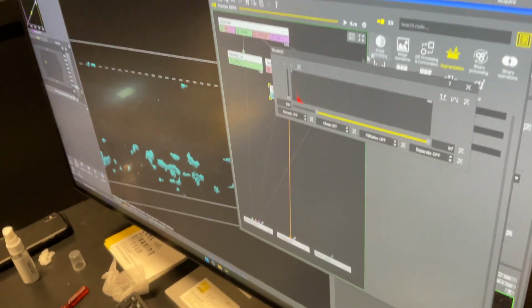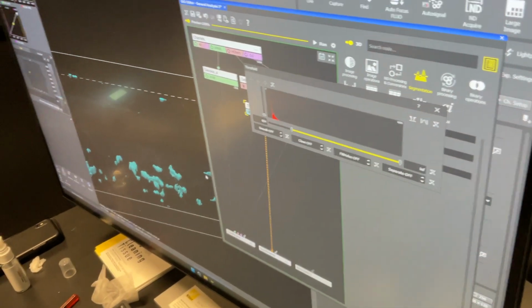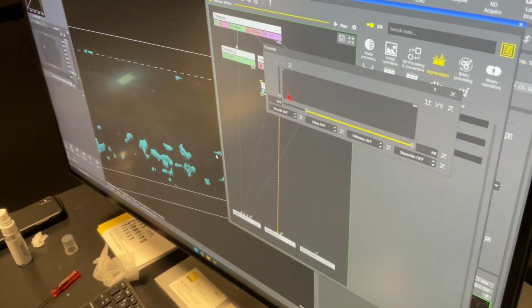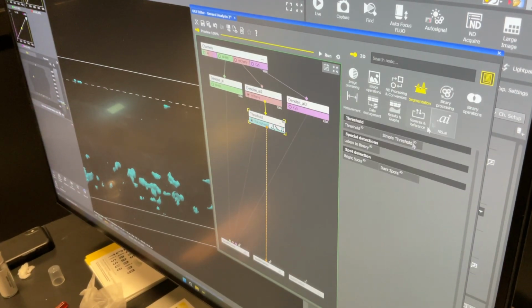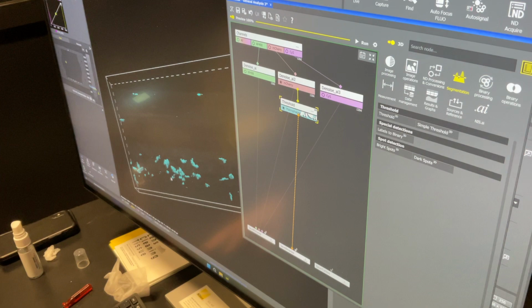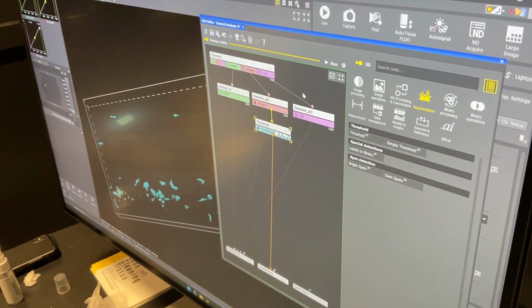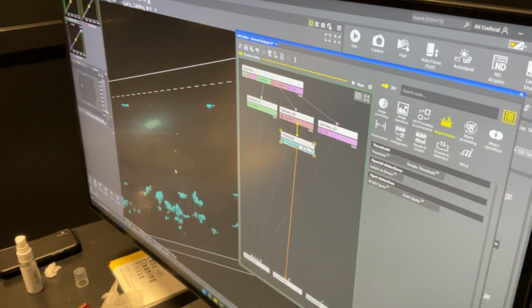This is something you can also do a lot of image pre-processing to narrow down, maybe boost those. And you'll see why it's not a problem, because you can see it. We want to make the segmentation layer so we can see it and measure correctly. So now I've got that, and you have a relatively simple tool. Now you just want to measure through these, but maybe we want to get rid of some of the little stuff.